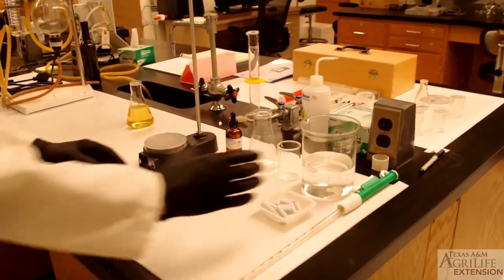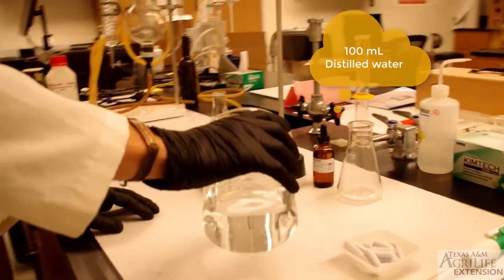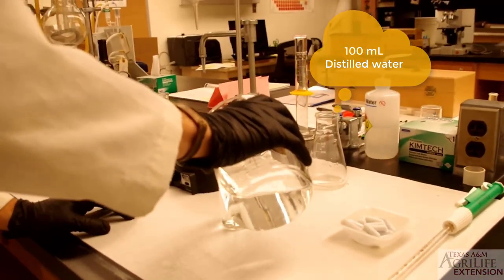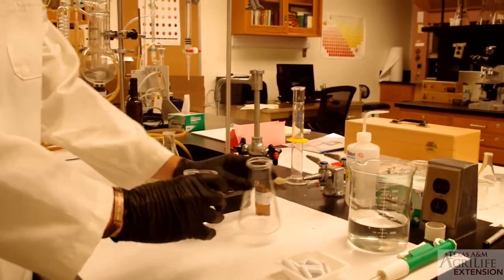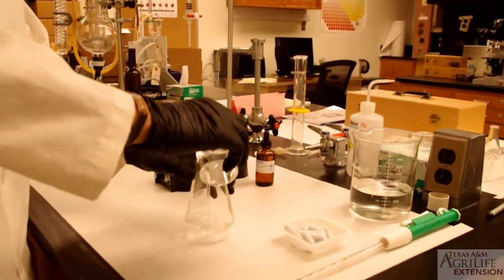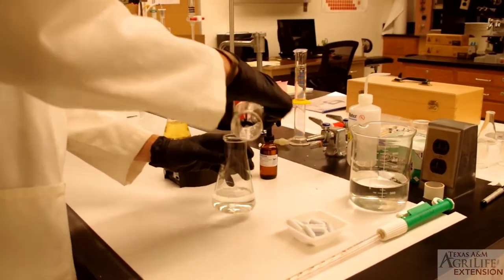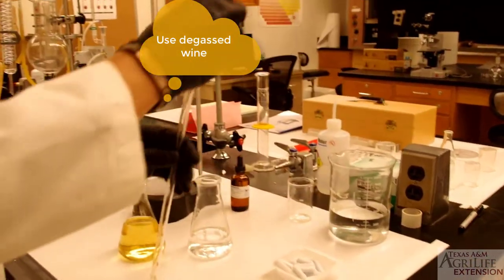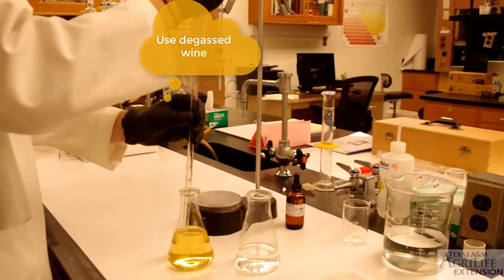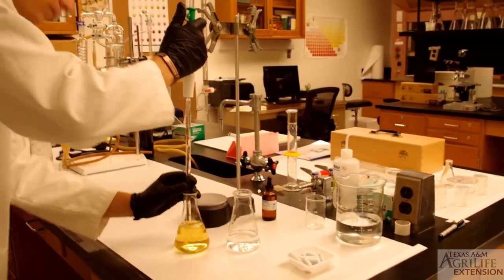We start to prepare our sample by measuring 100 milliliters of distilled water and pouring this into the Erlenmeyer flask. We continue by measuring 10 milliliters of our wine using the pipette and adding this to the distilled water in the Erlenmeyer flask.